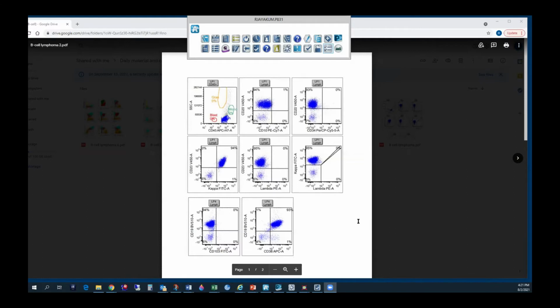So we use these lines, and sometimes some of our antibody fluorochrome combinations have a lot of background, and we ignore these lines many times. We say, okay, even if this looks positive, it's not really positive, because for example our CD56 will always be hyperfluorescent, and we used to ignore it unless it is very, very much on the extreme side. I think you get used to your antibodies and you know where they are positive, and after some time you stop seeing the lines.